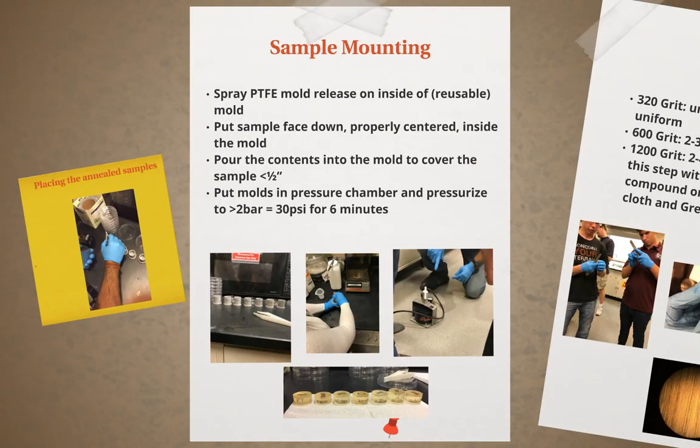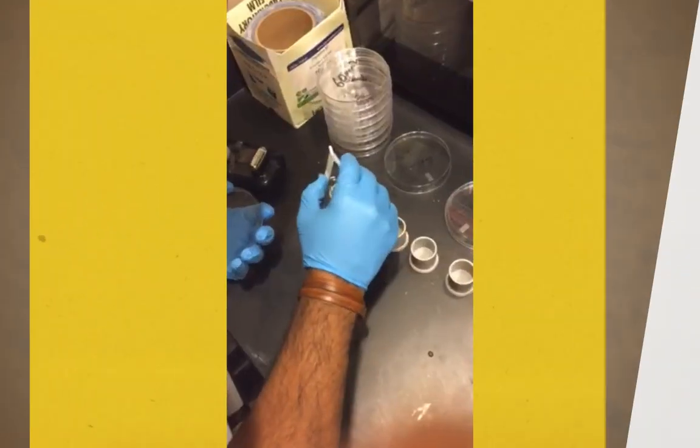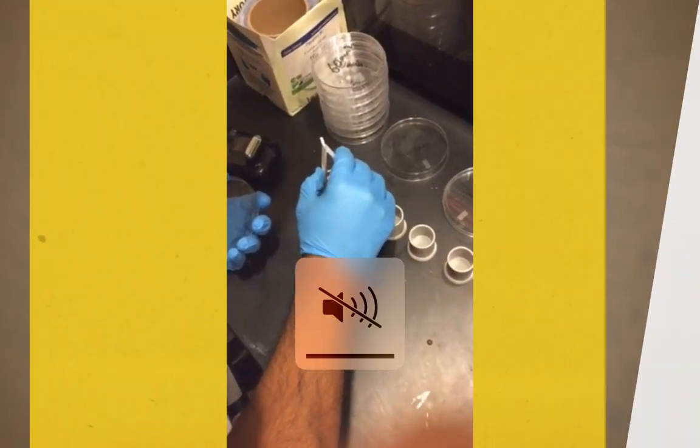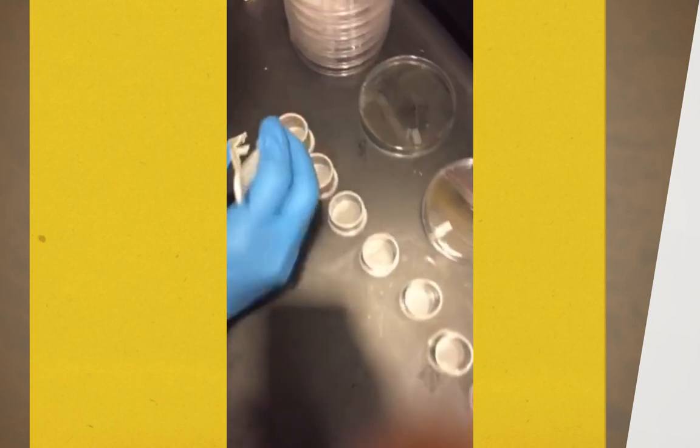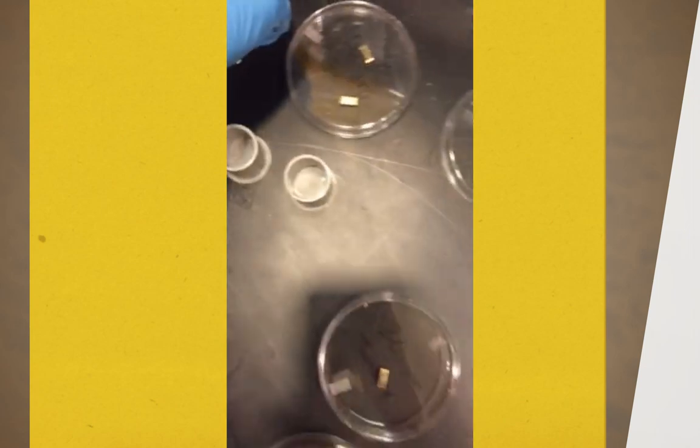Sample mounting is the next step in the preparation process. For each annealed sample at recrystallization temperature, a reusable mold will be labeled for each sample temperature. Before placing the brass cartridges into the mold, a PTFE release spray needs to be applied to the inside so the epoxy resin does not stick to the container. Once the container has its protective coating, the cartridge is placed face down and properly centered inside the mold.